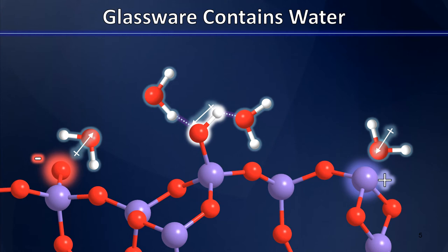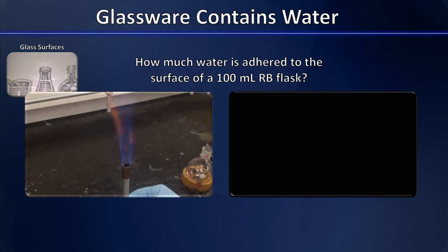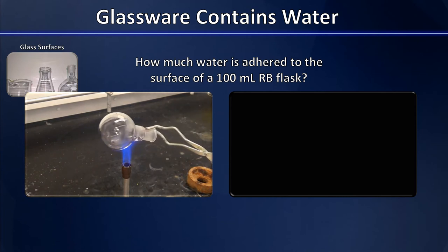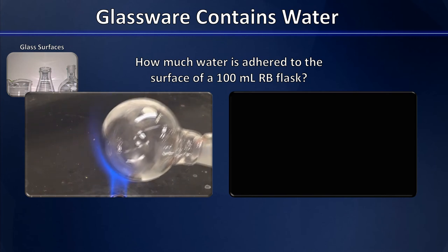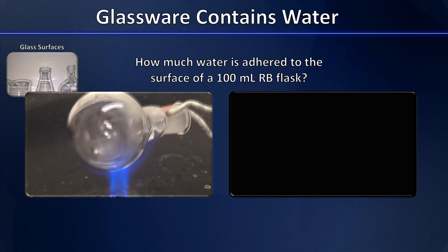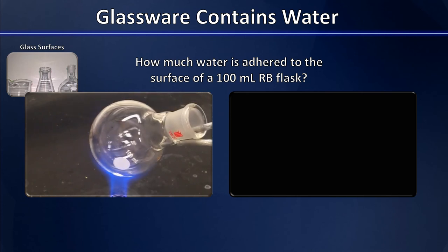So what are we to do to try to be sure that all of this water adhered to the surface of our glassware isn't getting into our reaction? The answer is we flame dry. In the first video I have a Bunsen burner set to have a nice well-defined cone in the middle of the flame. The temperature in that cone is about 300 degrees centigrade — not hot enough to melt the glassware but hot enough to drive the water off. As I place that glassware into the cone of the flame, you may notice condensation forming on the cooler parts of the glass. The water producing that condensation is coming from the hot parts of the glass, so by heating up the entire flask on all sides I can drive off all of the moisture adhered to the surface of my 100 mL round-bottom flask.